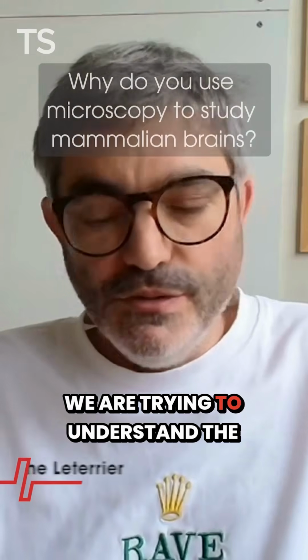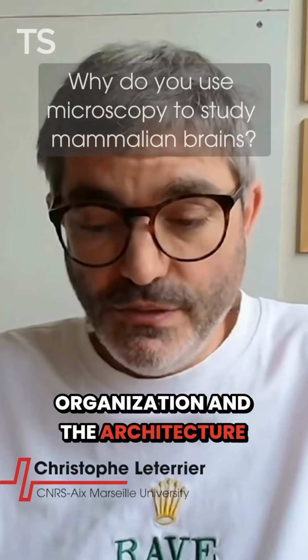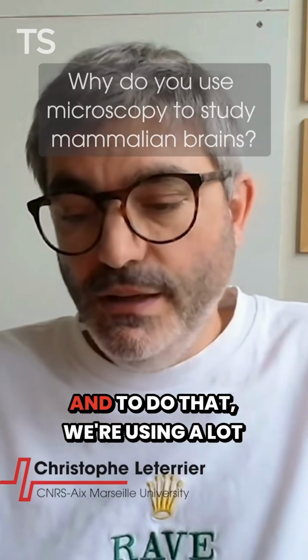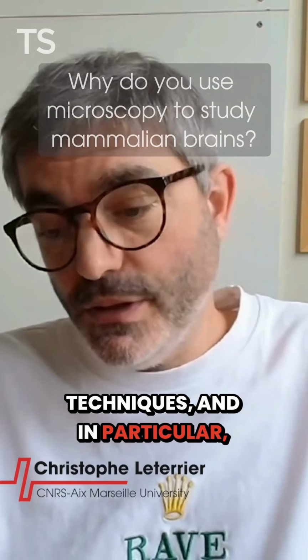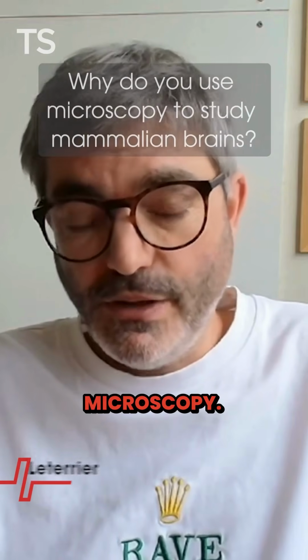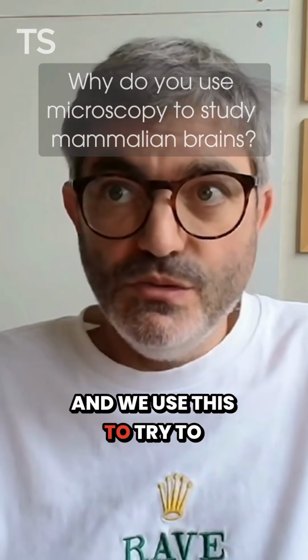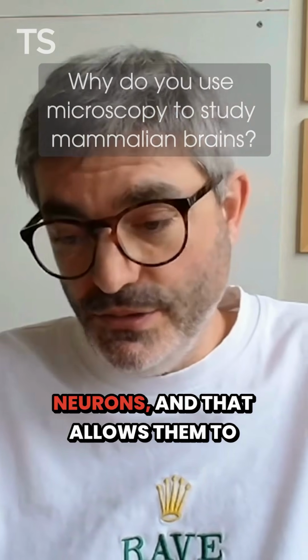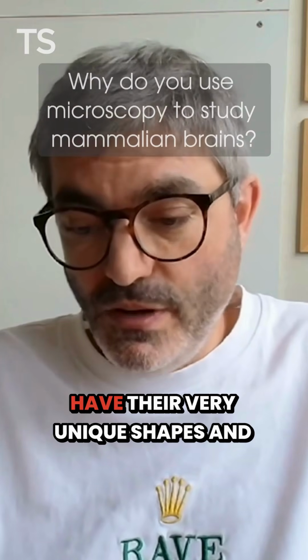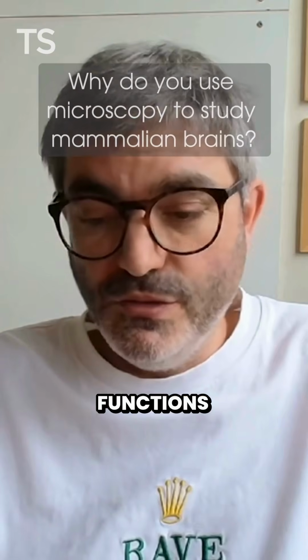We are trying to understand the organization and the architecture of neurons. To do that, we're using a lot of advanced microscopy techniques, and in particular, super resolution optical microscopy. We use this to try to understand several key structures that are unique to neurons, and that allow them to have their very unique shapes and functions.